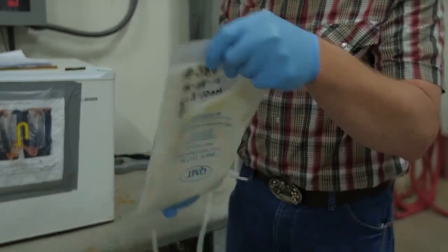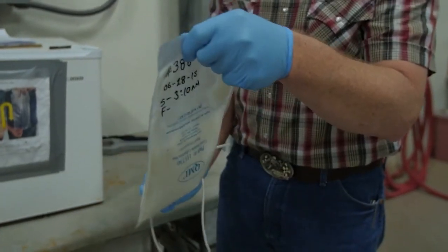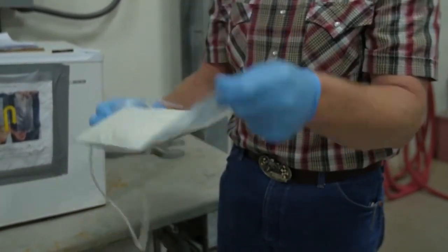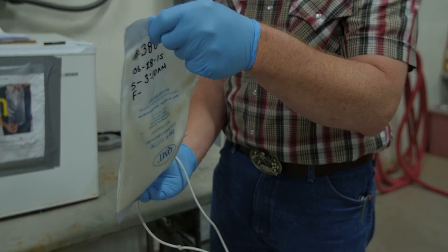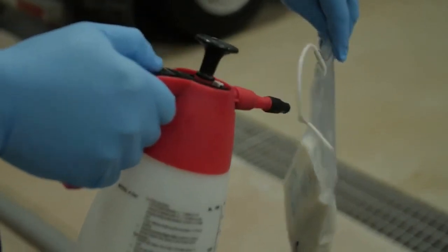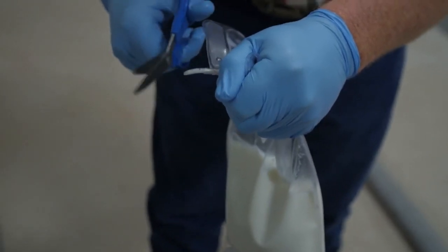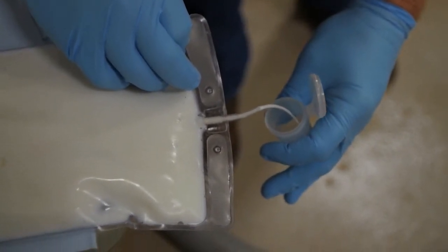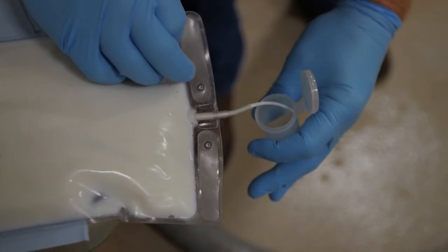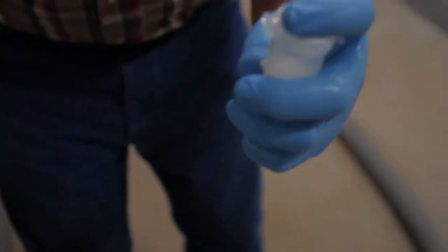Agitate the sample container sufficiently to obtain a representative sample by shaking the sample container 25 times in seven seconds with a one-foot arc of movement, or by rapidly inverting the sample container completely 25 times. It may be appropriate to wait three minutes to allow undesirable foam to disperse. Next, sanitize the tube and bag attachment point. Break the tube out of the bag, then flush a small portion of the bag contents to waste. Immediately transfer a portion of the sample contents using aseptic techniques into smaller, properly identified sterile sample vials. Only fill each three-quarters full.